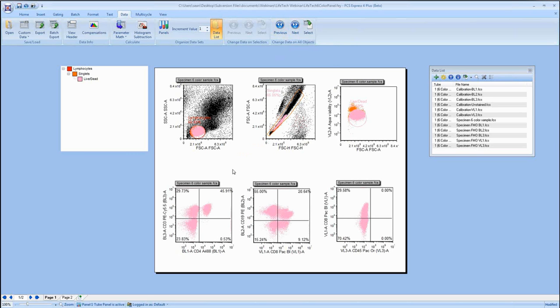And what you'll probably want to do is once you have all of this data in FCS Express, we have all these different quadrants set up that are all kind of updating for us in real time as we move them or change the data. We want to summarize all of these statistics somewhere. And to do that, I showed you before that you can use tables. And rather than setting up a really complex table with this data, I wanted to show you an example of something we've done already in FCS Express.